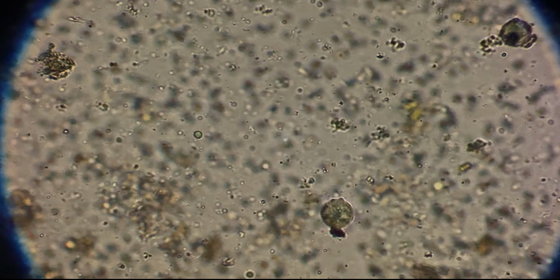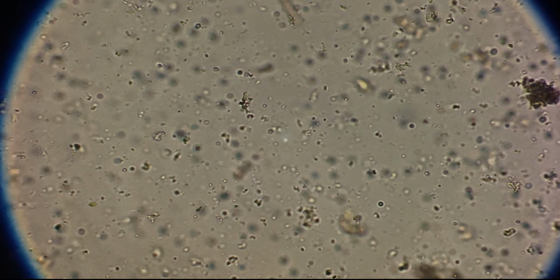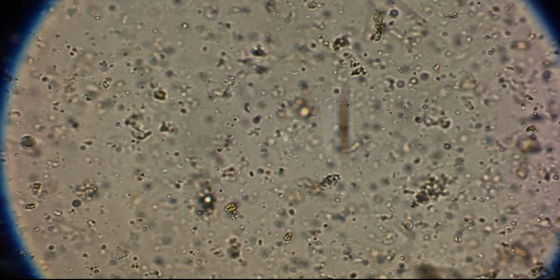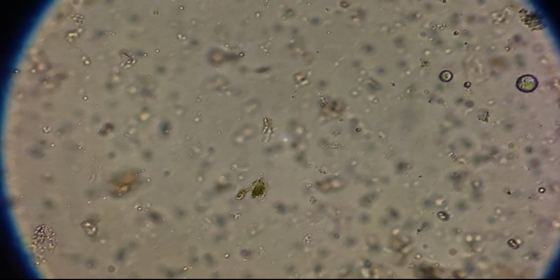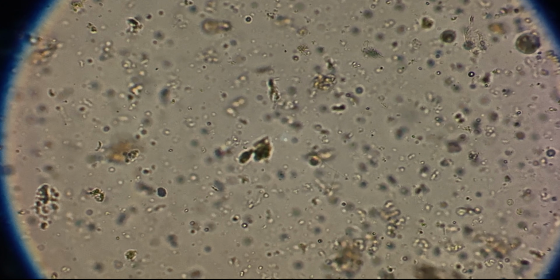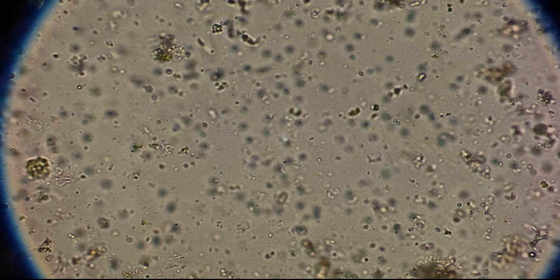Second, the enzyme actinidin. This enzyme is known for breaking down proteins. Since a lot of the machinery inside a living cell is built from proteins, an enzyme like this could interfere with the structures an organism needs in order to move or survive. Third, osmotic stress. This is just a sciencey way of describing what happens when the balance of water and dissolved substances changes suddenly around a cell. Cells are very particular about that balance. When it shifts fast, it can put the cell under serious stress.